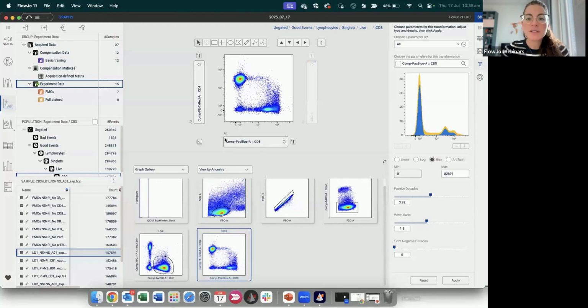Can you save a total analysis, including the report, also as a template? Not for now. So you can save the entire data analysis, but not as a template. Templates are coming.